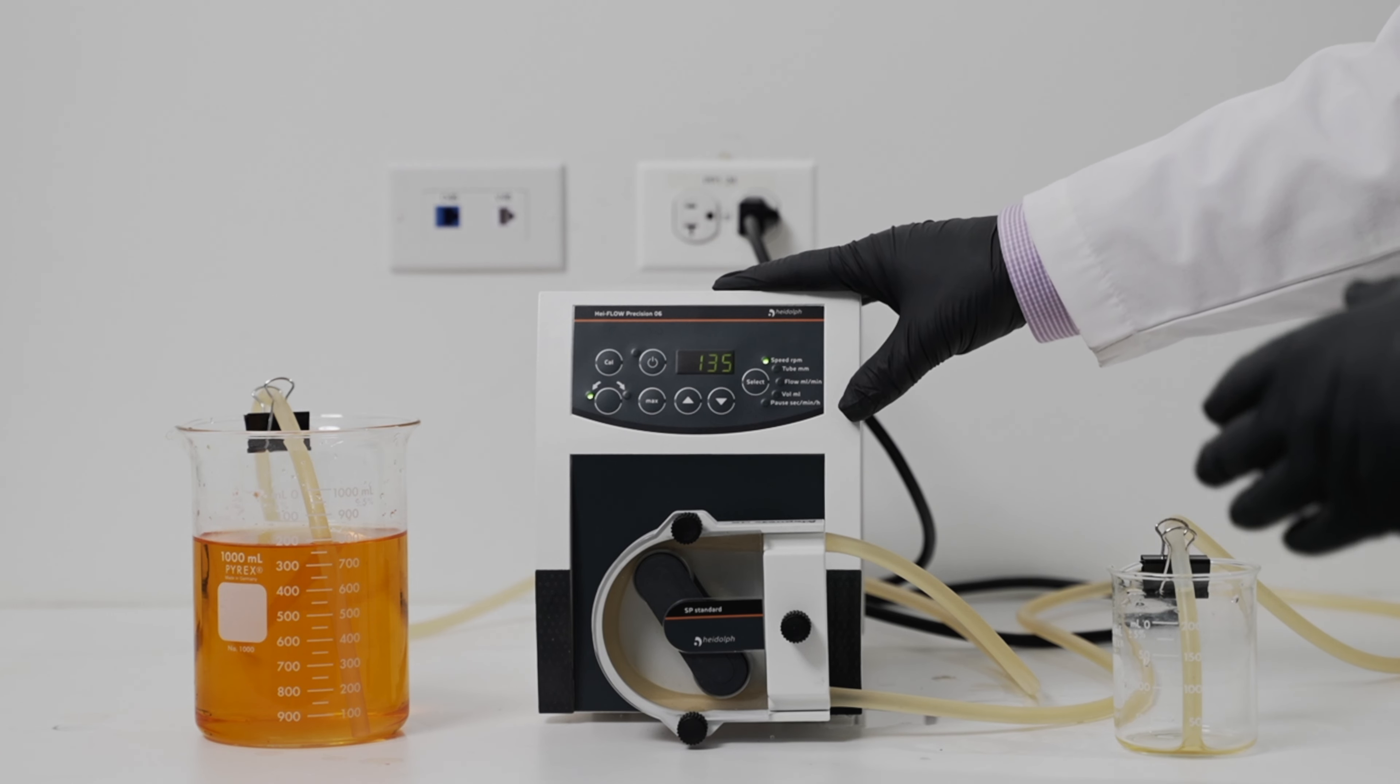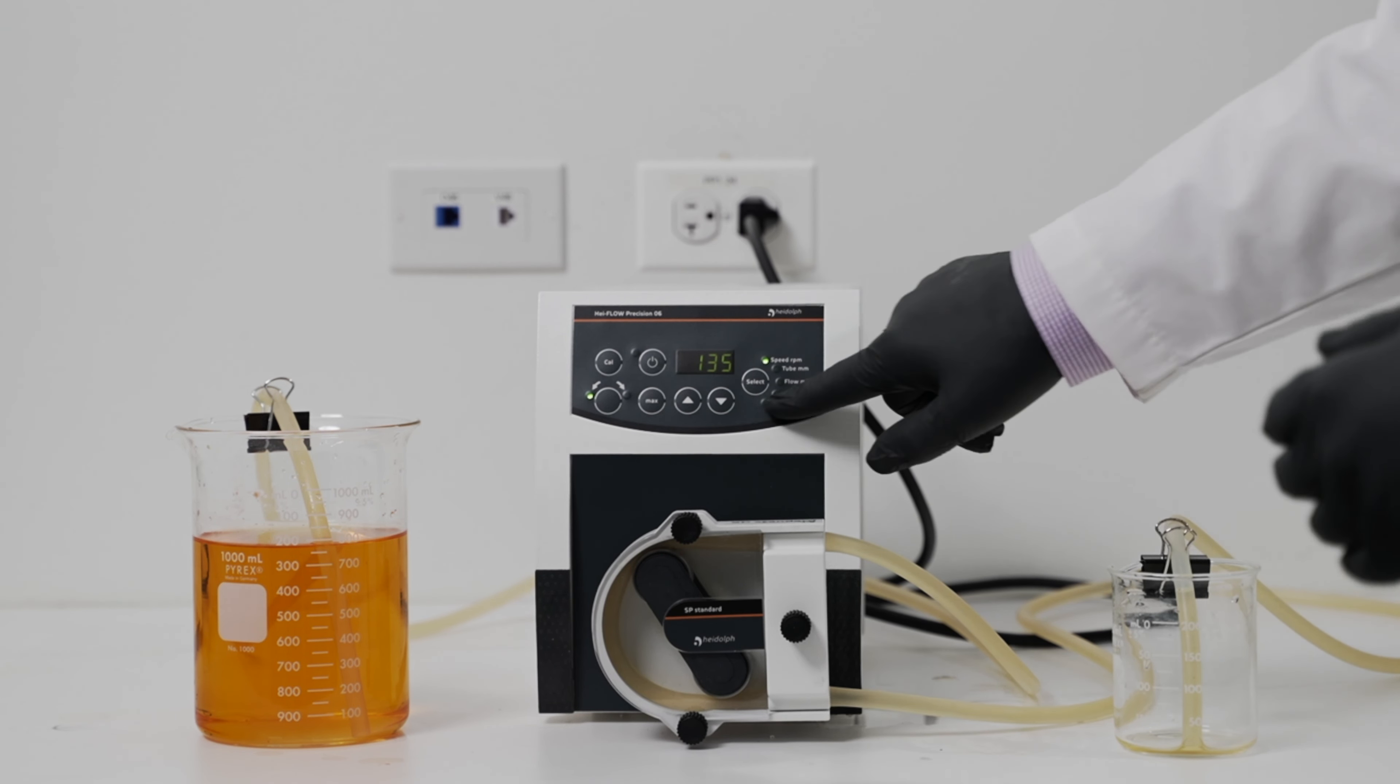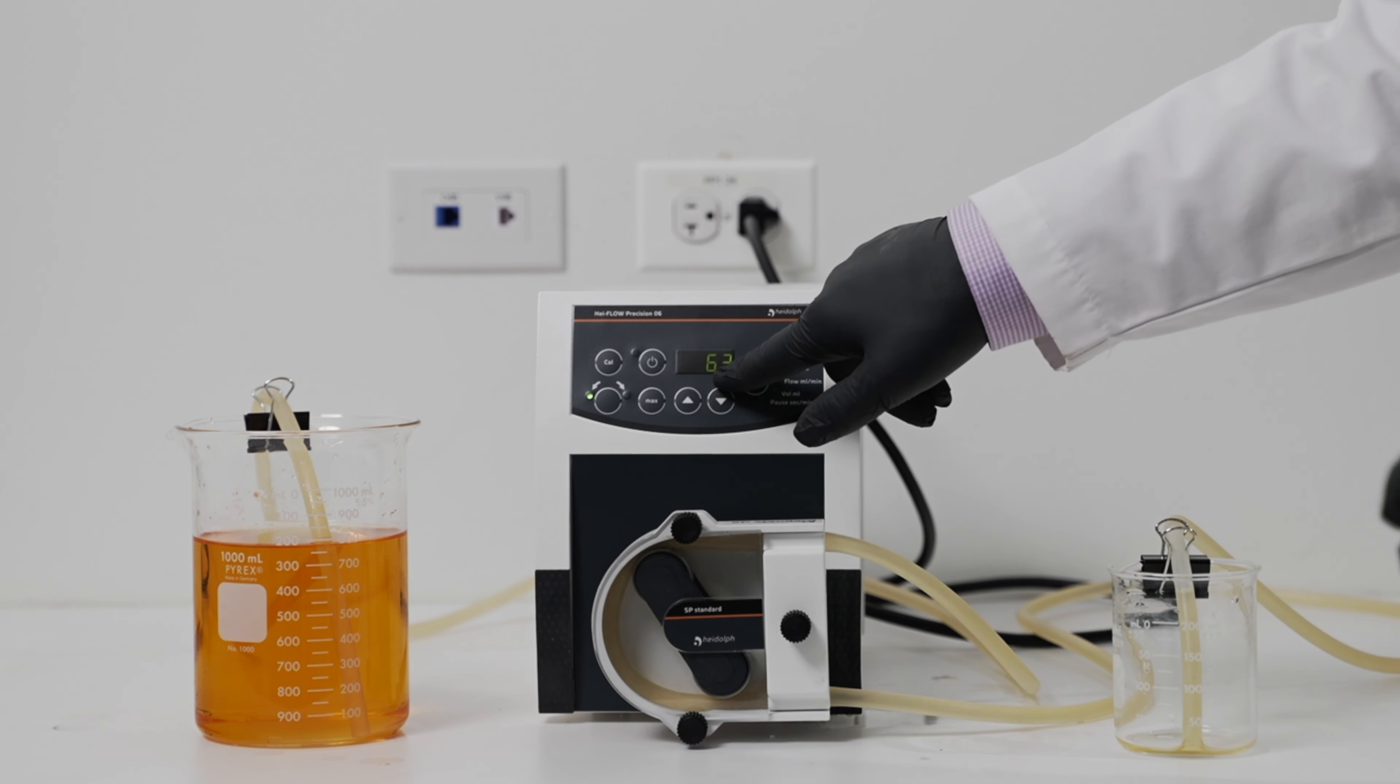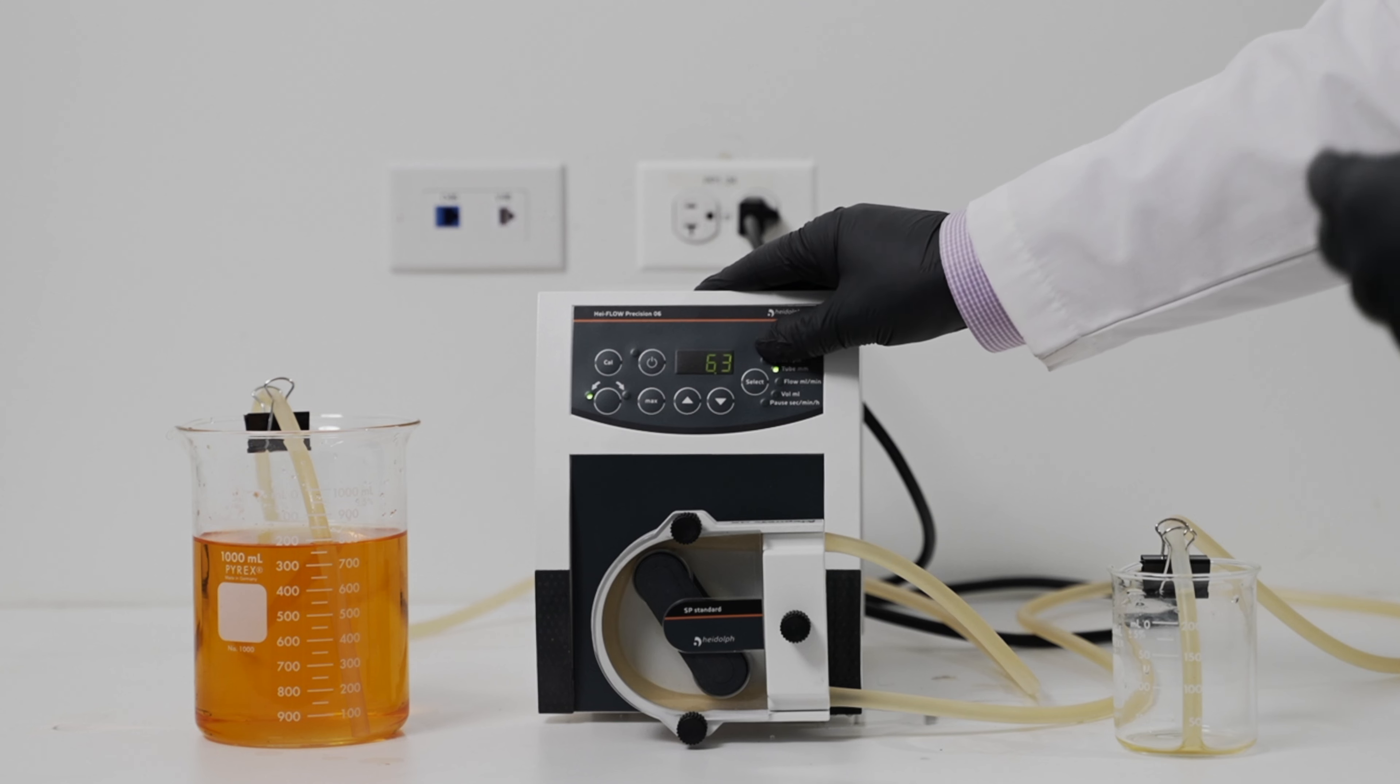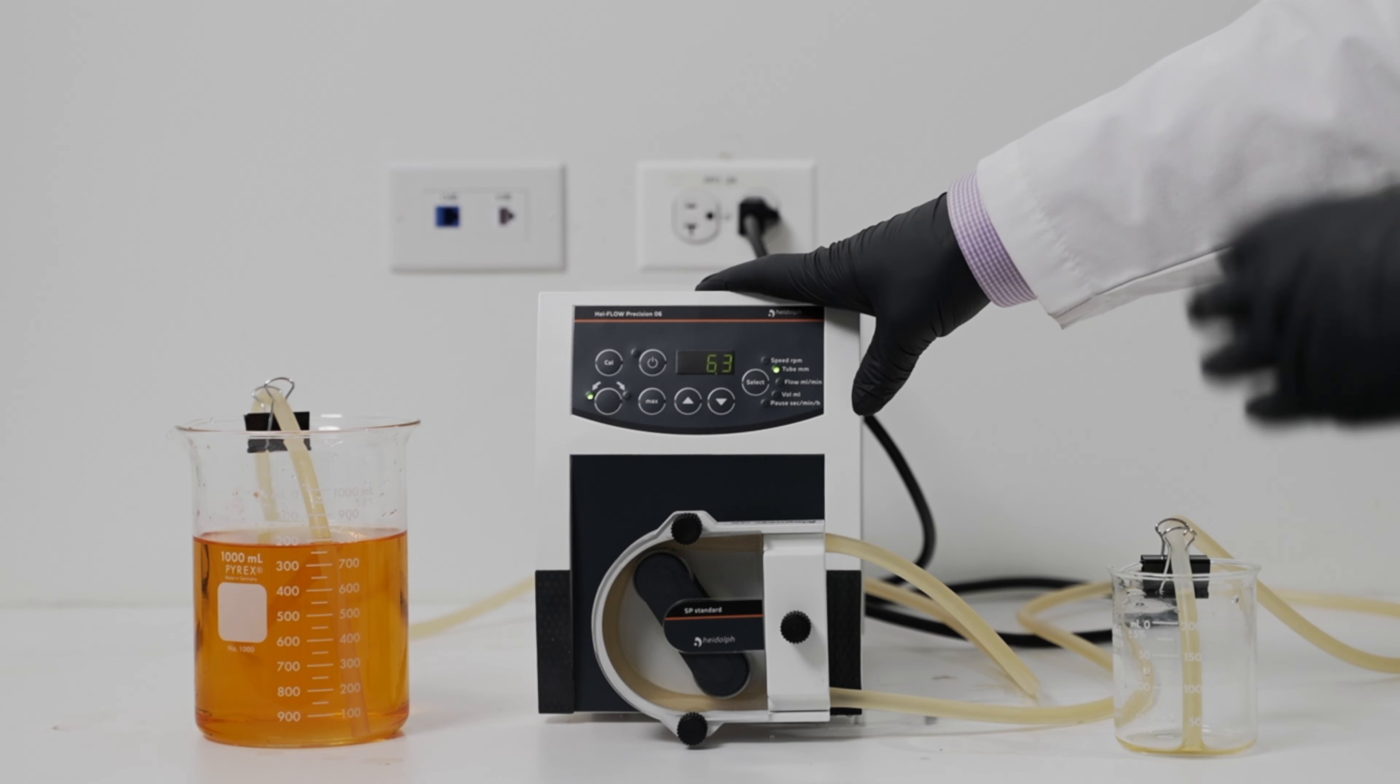The second will be to make sure that the tube size is set with your peristaltic pump. To do that, you can hit select once to go down to tube mm, where you'll see a tube size there. In our case, it is 6.3 millimeters, so we have that set. If the tube sizing is set incorrectly, you may notice some variance in the dosing of your volumes.